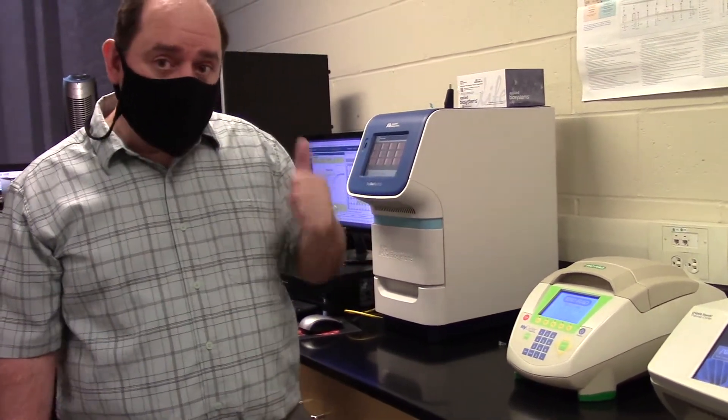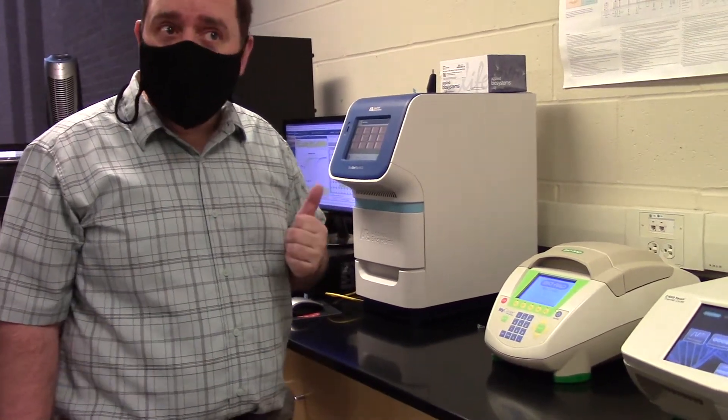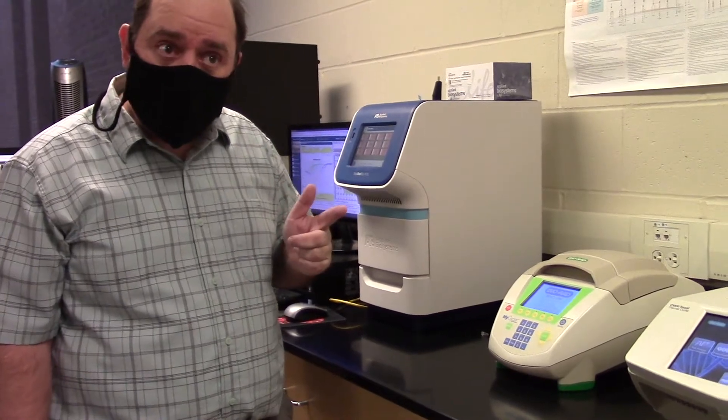Step one is 95 degrees Celsius, which is nearly boiling, to unzip the DNA by heat. Step number two, we're going to anneal the primers.